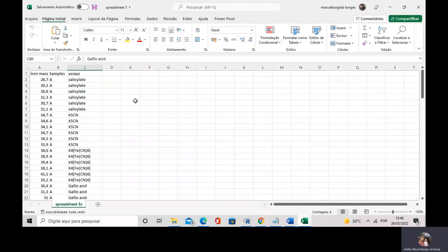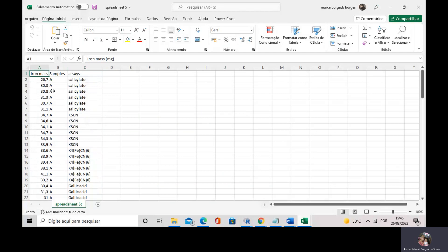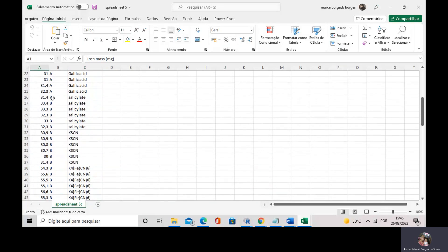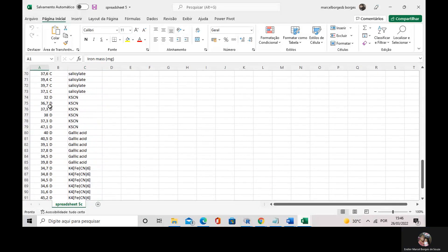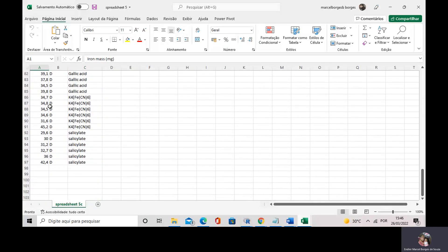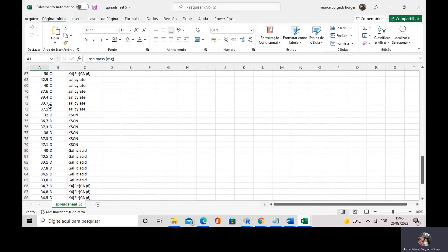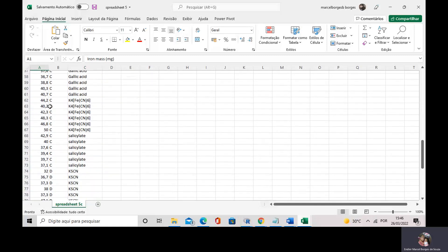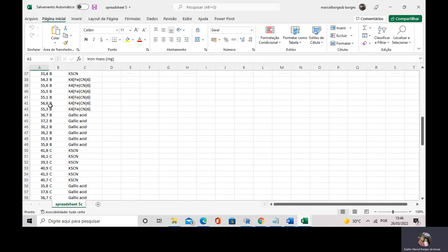Today, you are going to do one-way and two-way ANOVA. I have the iron mass that I have determined in two, in four supplementary, in four dietary pills.